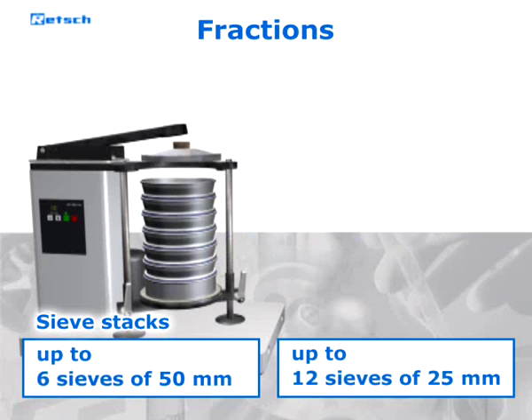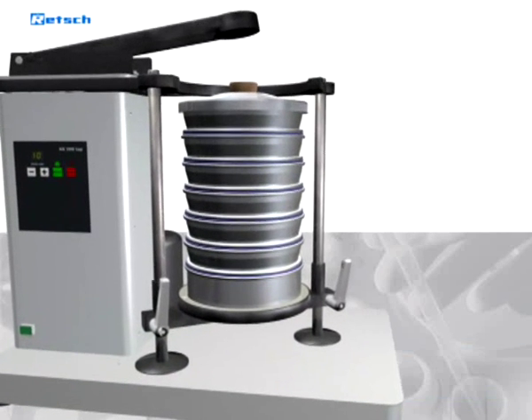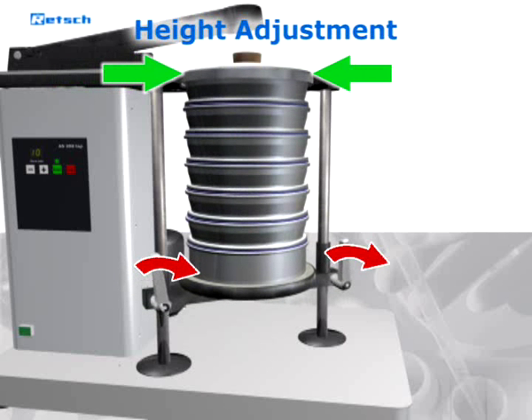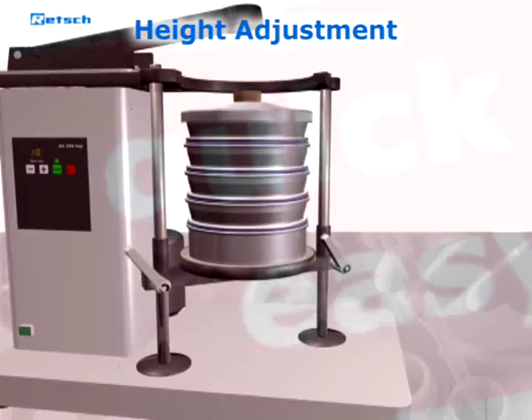The sieve stack is simply placed on the vertically adjustable sieve plate. To adjust the height, the clamp bolts are loosened and fixed again in the desired position. Thus, an adjustment to different sieve stack heights can be realized quickly and easily.